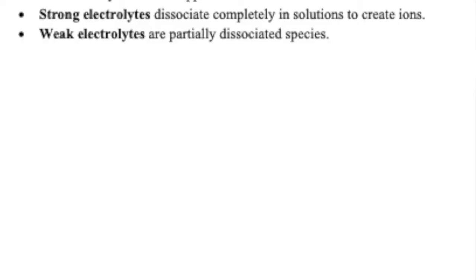We're going to rinse in a big beaker, and then between the KCl and the acetic acid, we better change that water altogether, right? Because the KCl is a strong electrolyte, has a lot more electrical conductivity than does the weak electrolyte with the same concentration, acetic acid, right? Now, we get that data. It takes much longer to make up the solutions than it does to make the measurements. It's really easy to make the measurements.